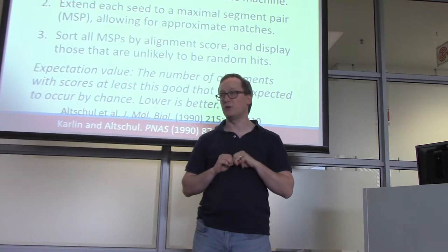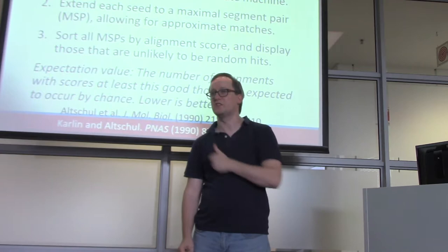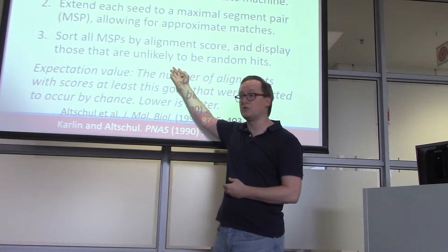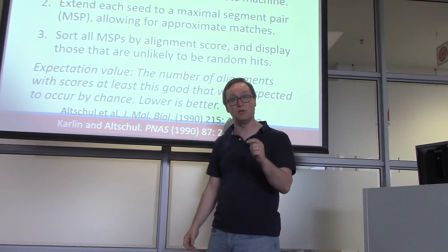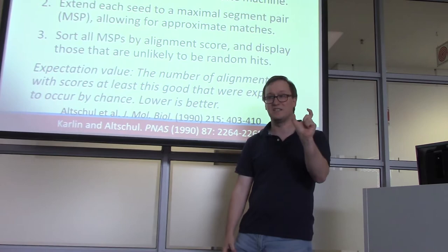That's a shortcut. So I said earlier that optimal algorithms attempt to give you what is provably the best correspondence between two sequences, whereas heuristics tend to give you a fast answer that may not be provably the best. So this seeding approach marks BLAST as a heuristic. It's only going to test whether sequences are similar if they have regions of identity within them, identical residues. So its approach is to look for 3-letter amino acid sequences, or I think 7 nucleotides. I've forgotten exactly. Maybe it's 12.